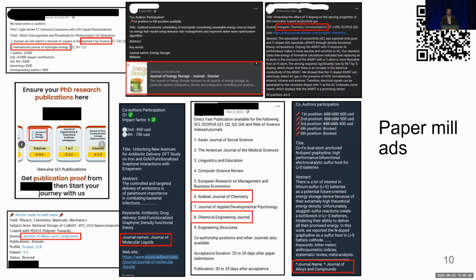You're absolutely right. And you get to a really interesting irony of this work, which is that only because people took this unnecessary reproducibility step that is quite rare were we able to spot instances where it had gone wrong. We narrowed down from a set of 1 million to around 174,000 articles that had SEM images in them. And from that, we got the 11,000. So the metadata banners are very frequently removed. However, we were using optical character recognition to recognize them, and it was very resolution dependent.